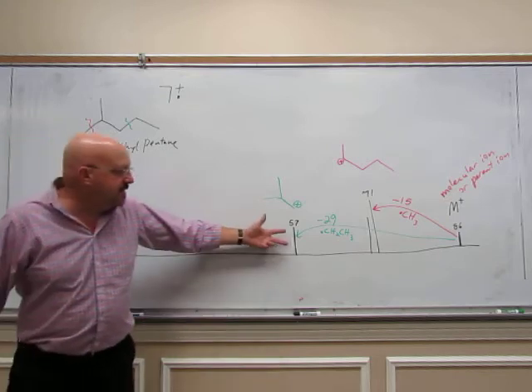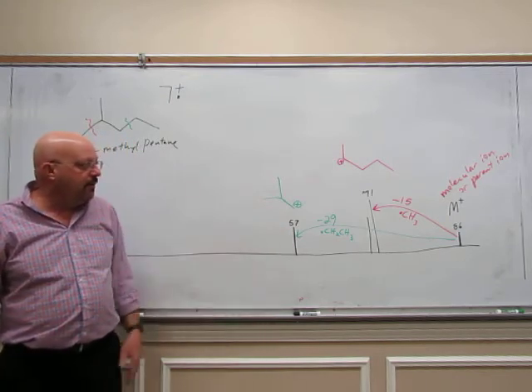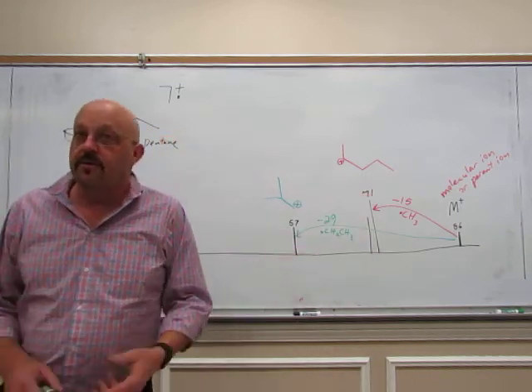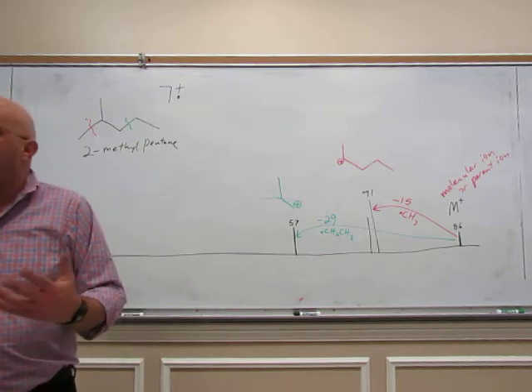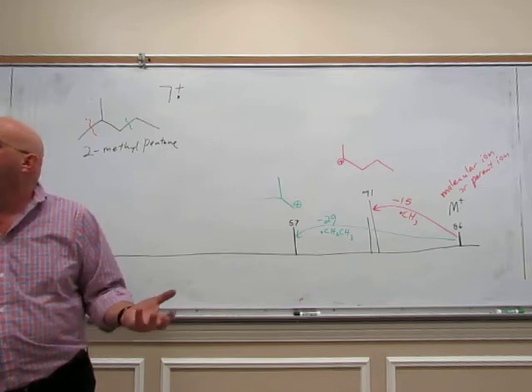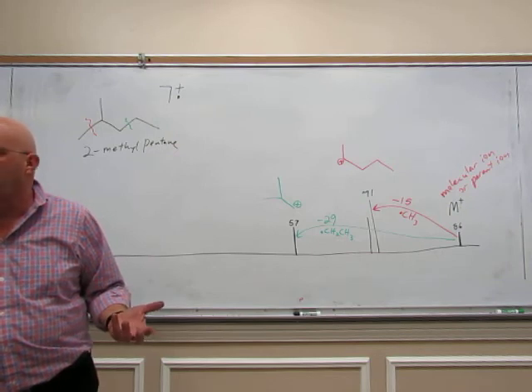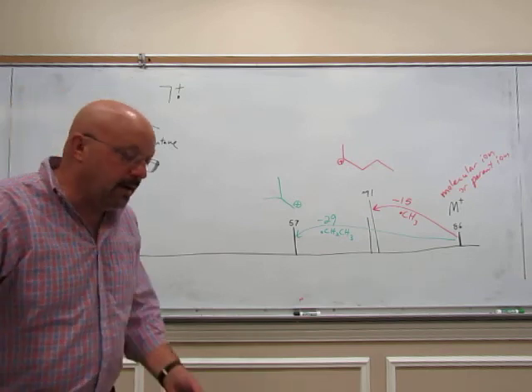You know, this one doesn't make sense. That's not following the rules. You might be able to figure it out like we did there. But your bigger peaks, you should be able to figure those out. So I'm not going to expect you to be able to identify every peak in the spectrum. Like on the exam, I might say, tell me what the 2 biggest peaks are. Something like that. You should be able to do that. You should be able to identify the 2 largest peaks. Now, let's see what else we can pick out here.